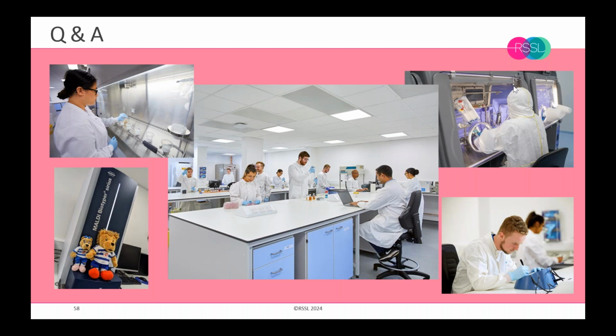And from Emily, can increased cleaning lead to a reduction in monitoring frequencies? I think it can, and in the model that I put across, you can redo it. You could look at different cleaning frequencies and see if that has an impact.